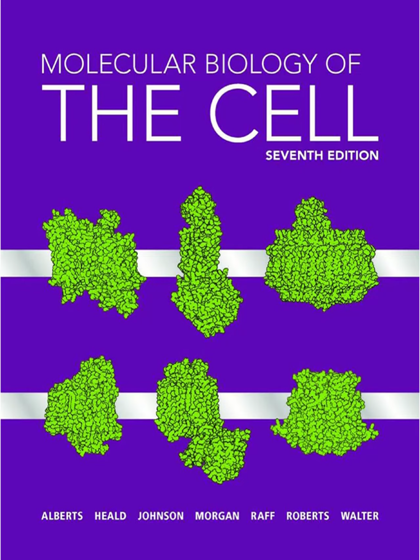Like static. A bit like static, yeah. This noise can obscure faint details. The more photons you collect, a brighter signal or longer exposure, the better your signal-to-noise ratio and the clearer the image. It's a huge deal for fluorescence microscopy, where signals can be really weak.